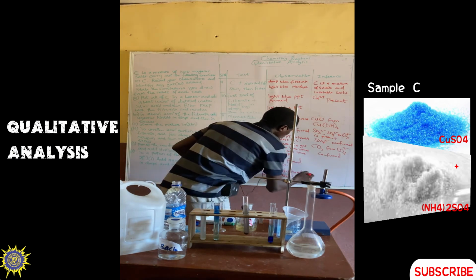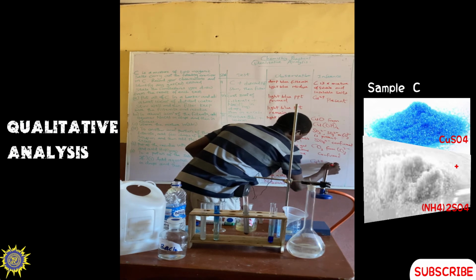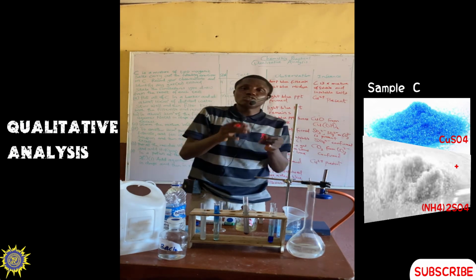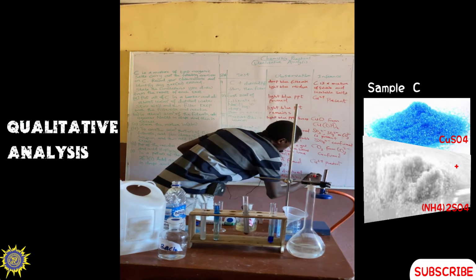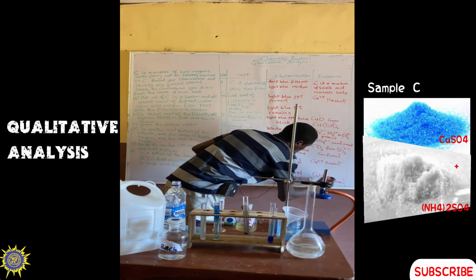So what do we get here? Cu2+ is present. And then this is the confirmatory test, because when copper dissolves in excess aqueous ammonia, we have Cu2+ confirmed.